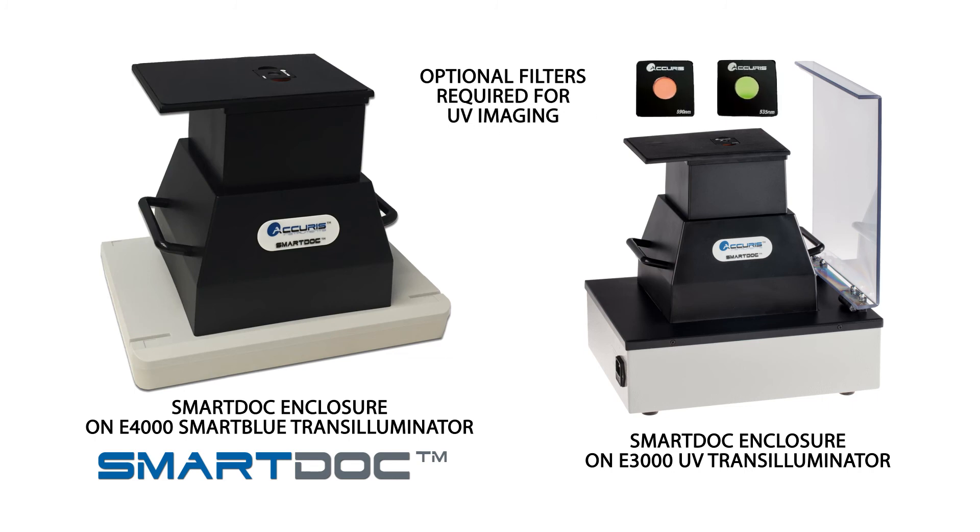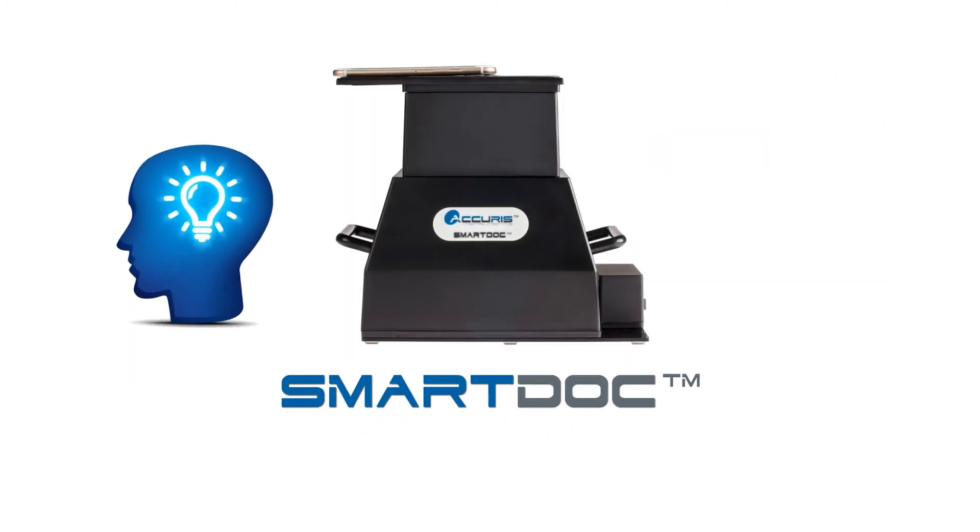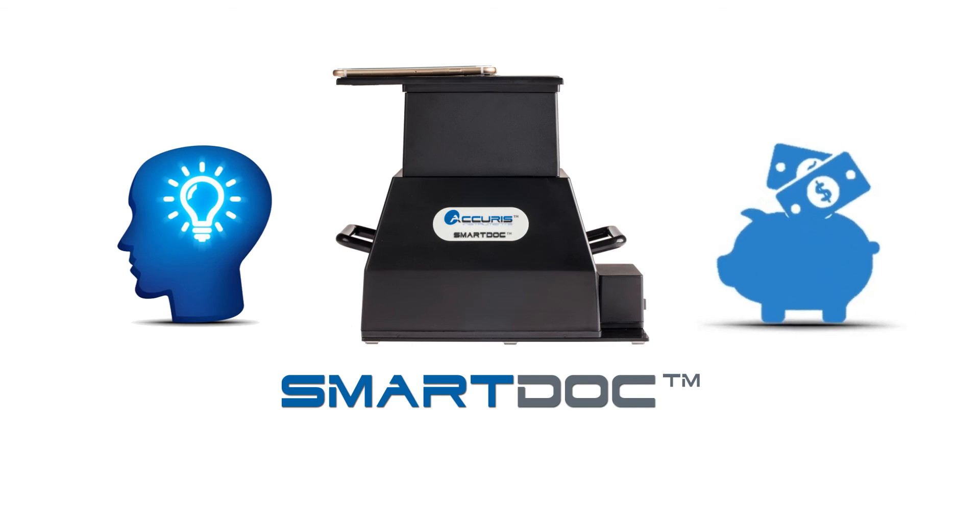Additional filters are available for UV imaging. The SmartDoc 2.0 is a convenient and economical solution for any life science lab, and is available from all authorized Benchmark Scientific distributors. For more information or an immediate price quote, please contact us at info@Acuras-USA.com.